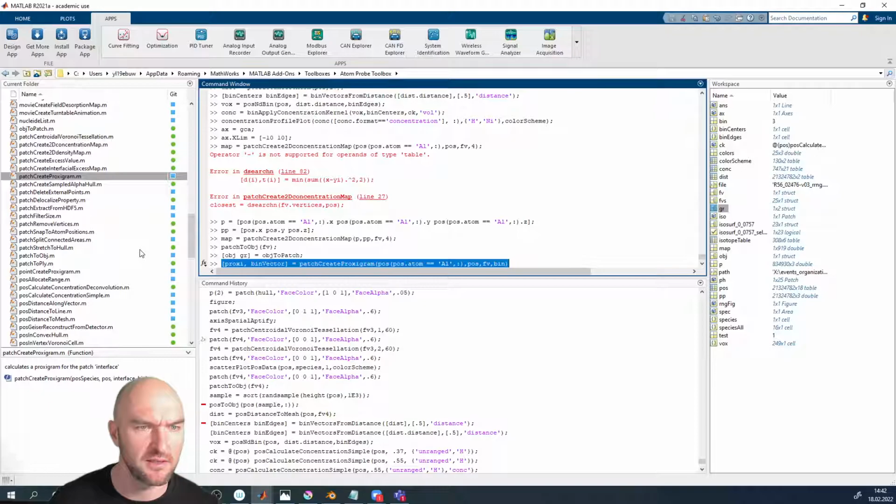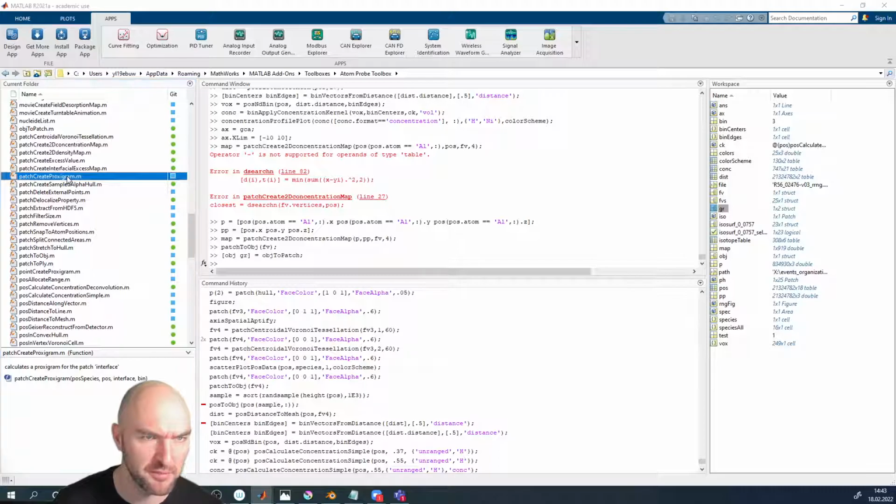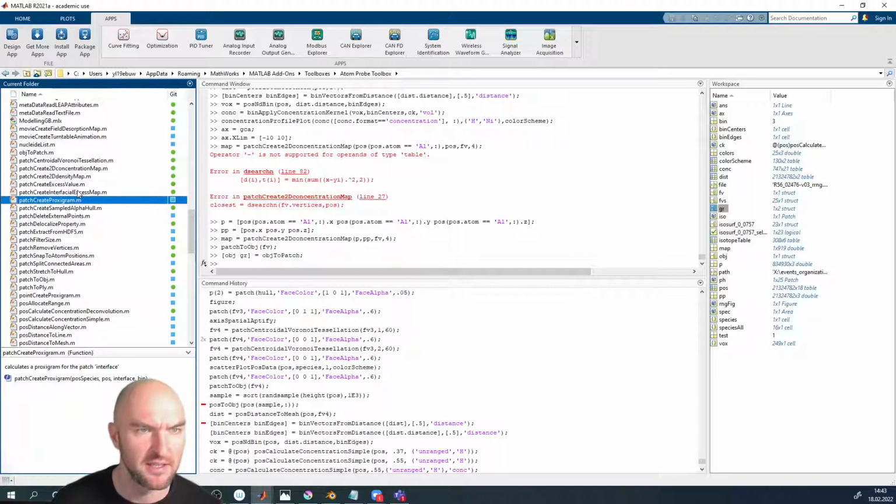Because we will do it through allocations. Yeah, so we're definitely going to implement it on the patch create proxigram command as well, so that they can come in with your vertex groups and define a local proxigram there.